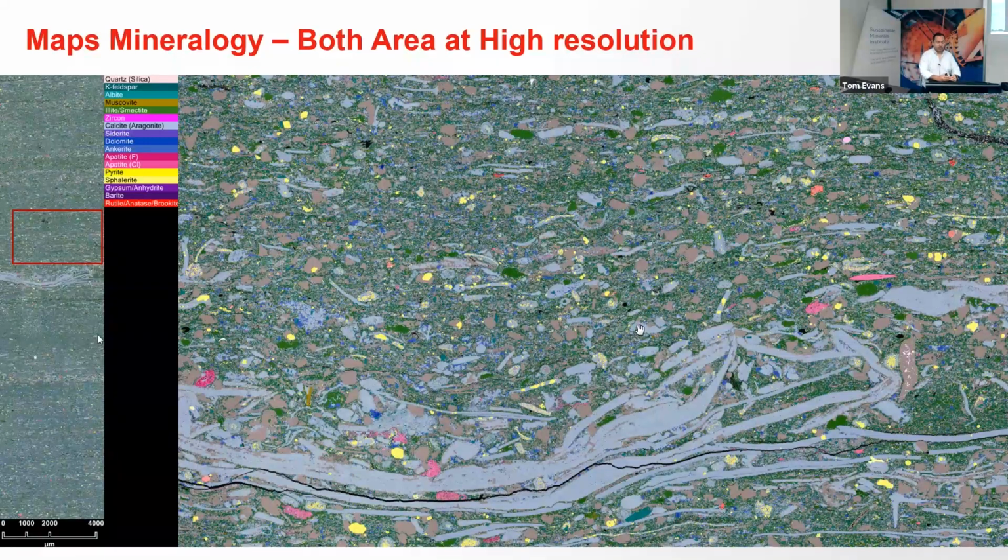So what we're doing now is taking a little bit of the concept of Google Earth, in the fact that all the images are stored as a pyramid. So the software doesn't load everything into memory, but it loads whatever image you are visualizing at one given time on your monitor. When you zoom out, it loads a downsampled version of the image, and when you zoom in, it gives you the full resolution of the image. So that we can visualize very large acquisitions on regular computers. Of course, to classify them, it requires more powerful computing systems.